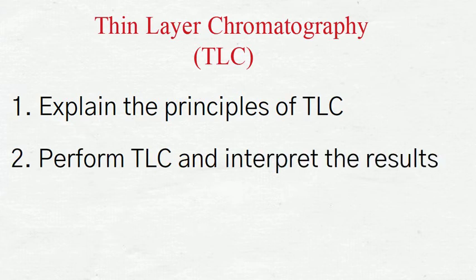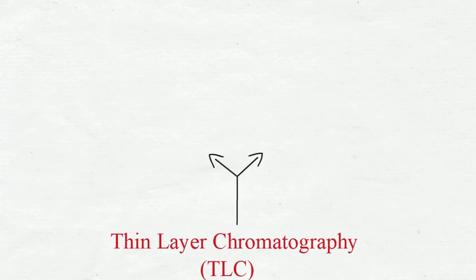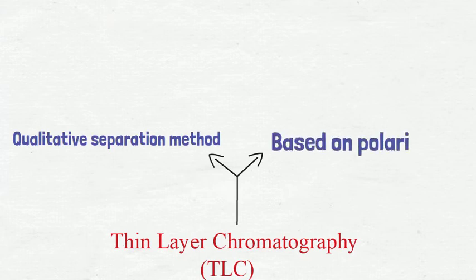Let's say you have done a new reaction and you're not entirely sure when the reaction is going to be completed. How can you check the progress of the reaction? Or, let's say you have gotten your product but want to know if there are any side products or unreacted starting materials present. How can you test that? Well, TLC is one method to help you out. It is a qualitative method based on polarity to help us visualize what is going on in the reaction mixture.